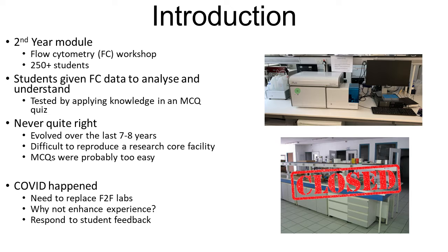Now, pre-COVID, students received a data file from a flow cytometry experiment on whole blood. They were asked to read the instructions and analyse and count different types of cells in a workshop session. They were then assessed by a multiple choice quiz.